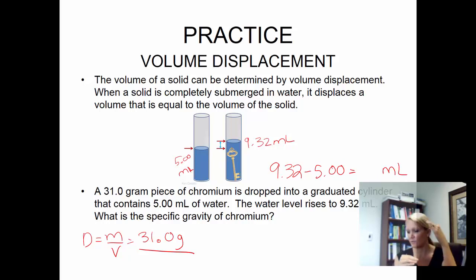So you had your start level and you had your end. When you do that, you get 4.32 milliliters.